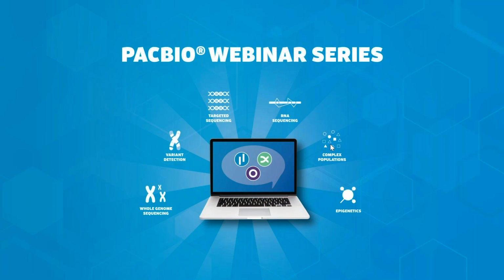Right. Okay. So I'll also shout out, I see we have Alicia Clum on the line. Alicia Clum's a bioinformatician at JGI, who's one of our longest customers, actually. And she says that she uses metaFlye out of Pavel Pevzner's group at UCSD. And she says that it's fast and doesn't require error-corrected data, but you can provide it.